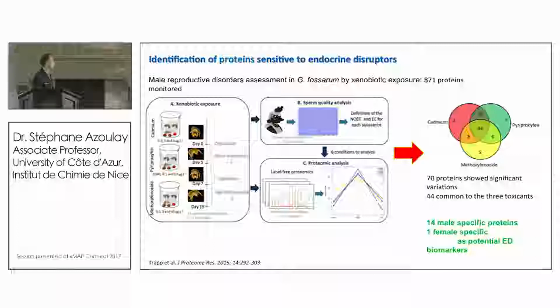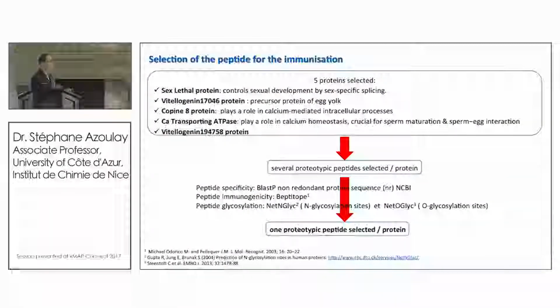Following that, to have a proof of concept of our approach, we decided to follow the proteins by multiplex Luminex technology.